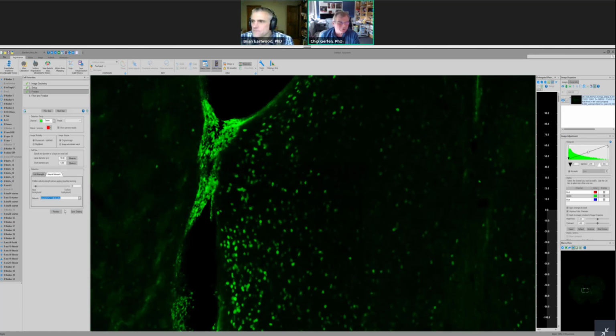So what Brian's referring to is that version 7 did a pretty good job of getting rid of, it was trained with a lot of artifactual labeling, and now we did more and more. Oh, and so this did a good job. This is version 13. It actually did a better job of picking out than version 7. Again, picking the parameters is very important, but also picking the network that's applied.